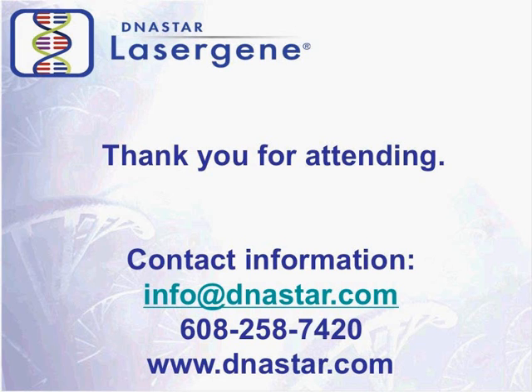I'd like to get all of your comments about the growing prevalence of longer reads. A couple of you mentioned PacBio. Matthew, you mentioned Ion Torrent. I dare say after AGBT next week we'll be hearing about one or two other potential long-read platforms that are on the verge of being commercialized, which is very exciting. Presumably that's good news for de novo genome assembly, but does that raise additional problems? Do you have to reevaluate steps of your pipelines if you have access to these longer reads? Give me your thoughts. Ian, I'll start with you.